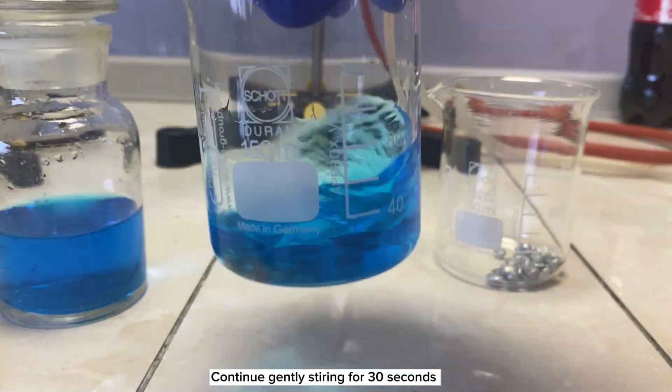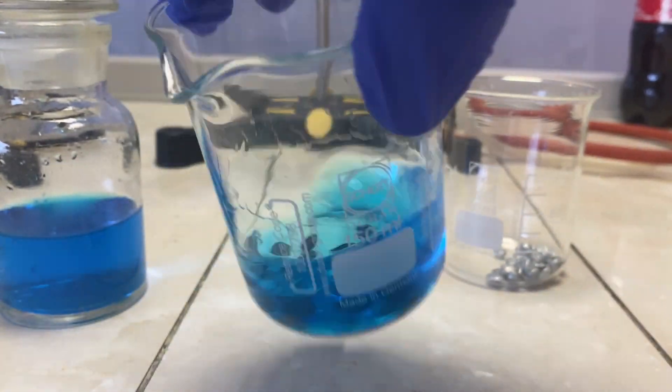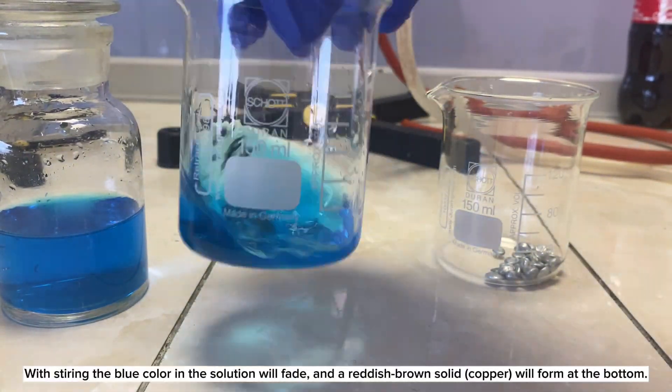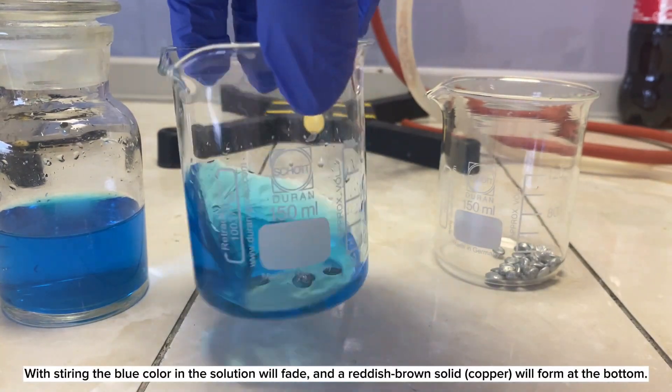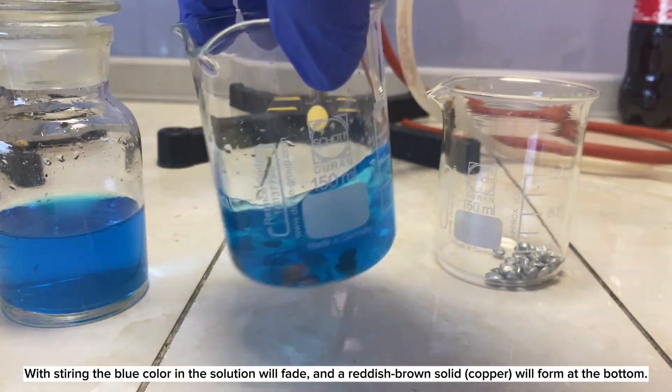Continue gently stirring for 30 seconds. With stirring, the blue color of the solution will fade, and a reddish-brown solid copper will form at the bottom.